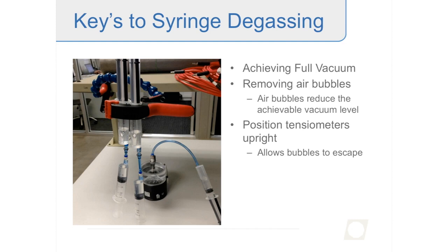I set the tensiometers up in a clip in the lab to hold them upright with the ceramic pointing down. I'll leave them set up overnight to allow the degassing process to happen and get the water as well degassed as possible. It also helps to degass the water previously, whether using a vacuum system or by boiling it — though you want to let it cool down first.